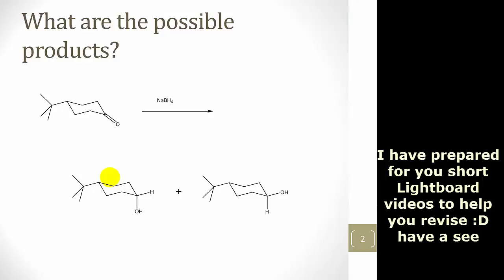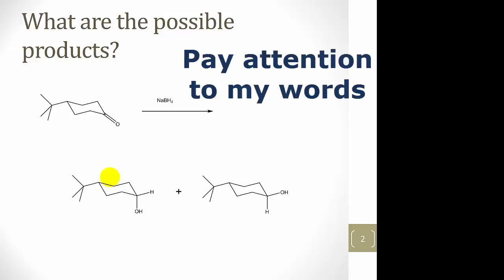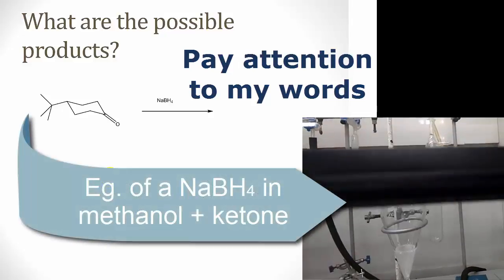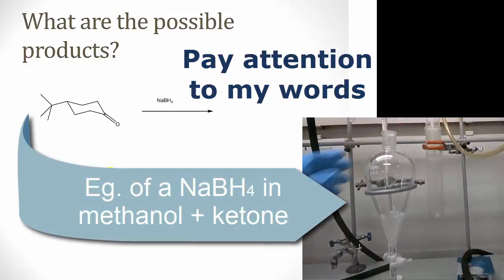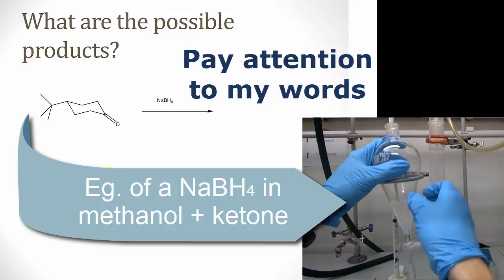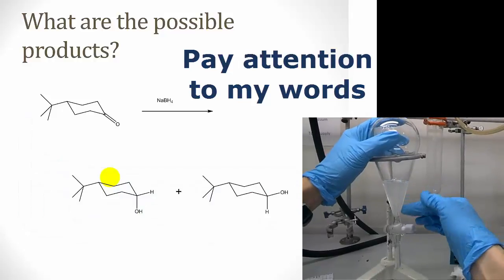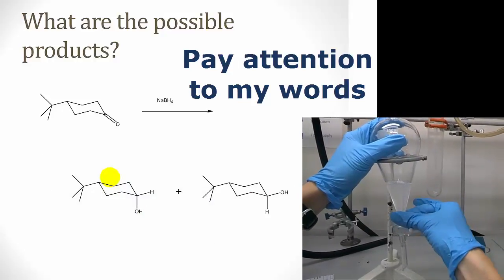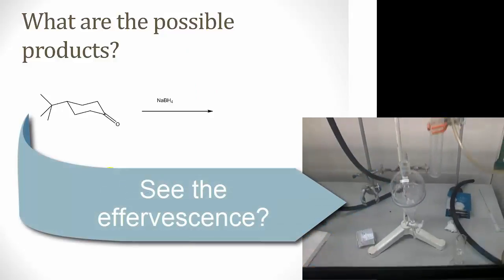Now, sodium borohydride is a reagent commonly used for the reduction of ketones and aldehydes. Other reducing agents such as lithium aluminum hydride can react violently with water and alcohol to produce hydrogen gas, while sodium borohydride reactions are commonly run in methanol or ethanol as a solvent, as sodium borohydride is significantly less basic and the acid-base reaction is much slower.